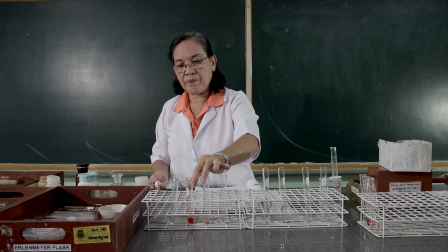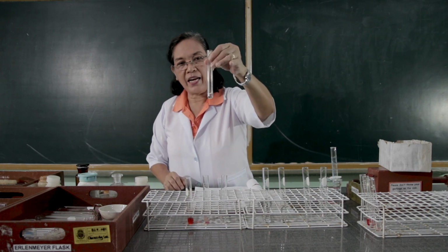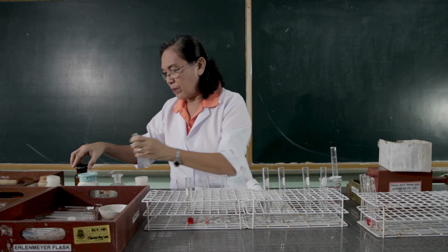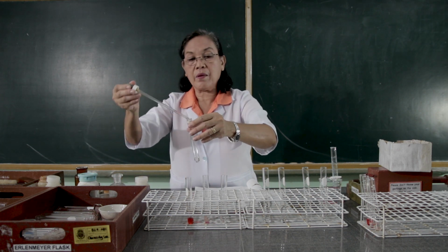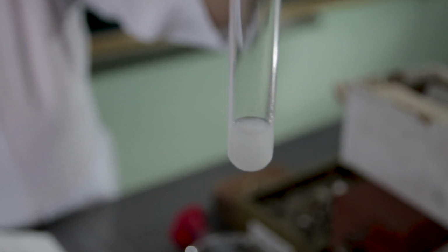Observe what happens. To the fourth test tube containing the acetic acid, let's add the phenolphthalein. Observe what happens.